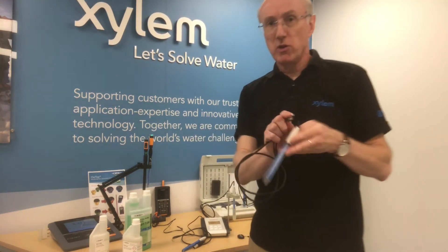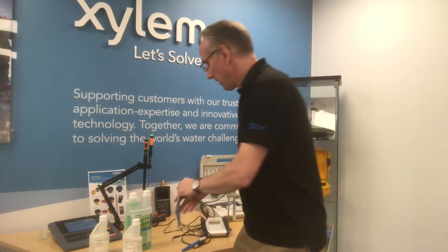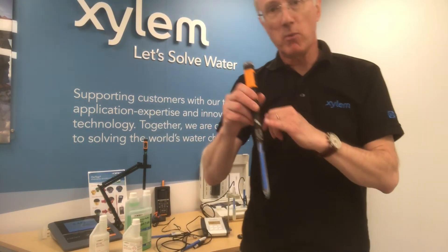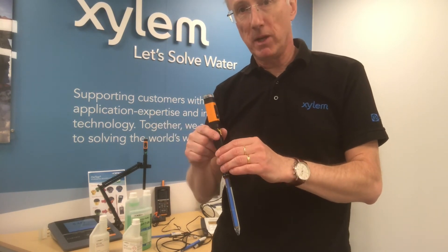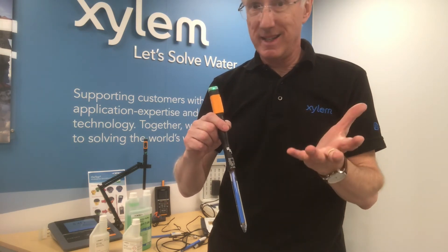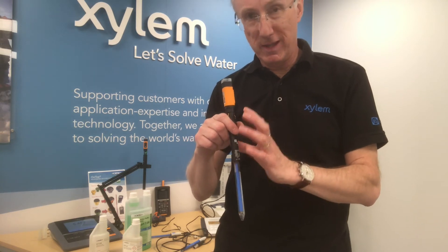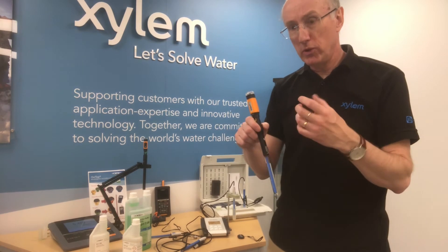In terms of electrodes, this is a glass analog probe, but we also have digital probes — here is a wireless digital probe connected to a meter behind me. What's important is that the way in which the probe works is exactly the same whether it be digital or analog. The inside of the probe is exactly the same, so it's very important that you look after it and maintain it.